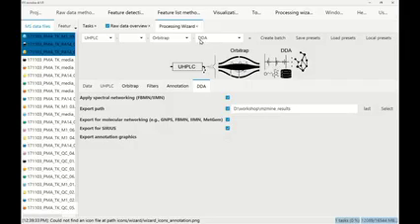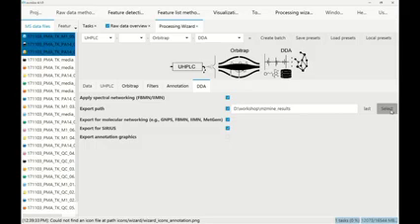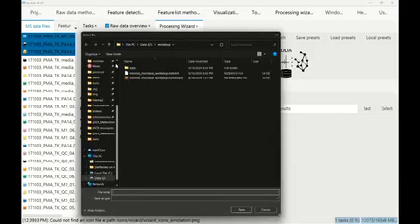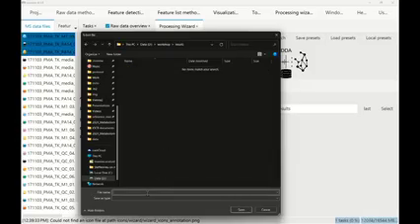But here we're going to use the data-dependent acquisition workflow, and the only thing you have to set up is in the export path, please select a full path. So you click on Select here on the side. We can create a new folder and, for example, just call it Results. And it's then important, or at least good, on the bottom, we could then say Metabolomics Workshop Results or something like this. So we just give it a base file name.